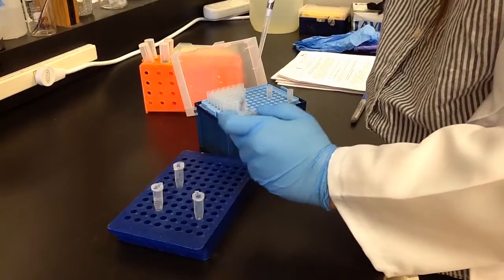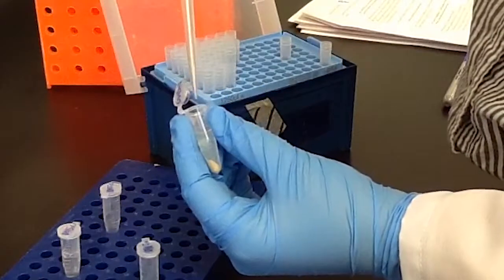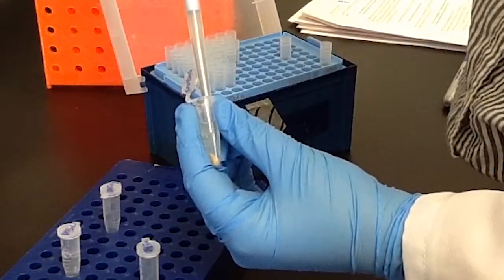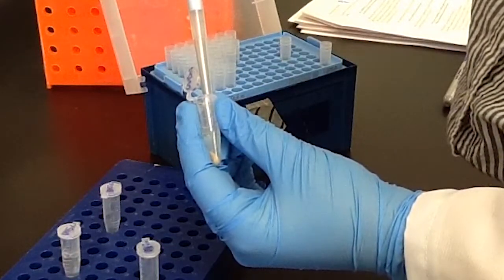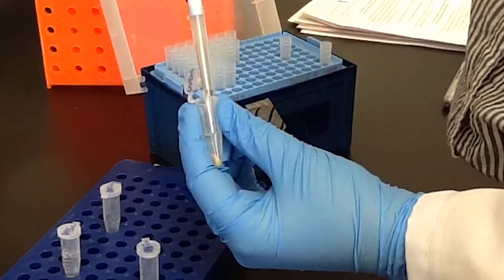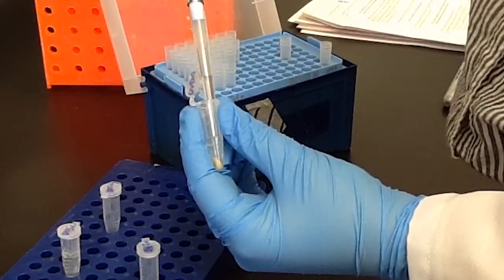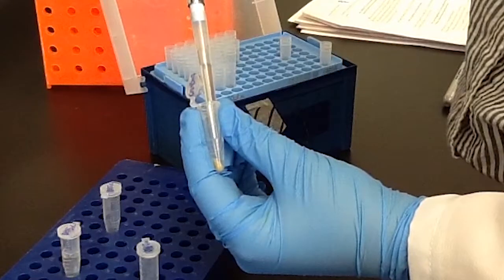I then centrifuge the lysate at 20,000 XG at 4 degrees Celsius for 30 minutes and collect the clear lysate. I do this by removing the supernatant and transferring that to a clean Eppendorf tube.